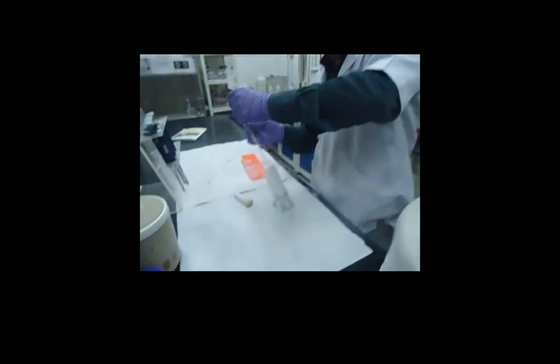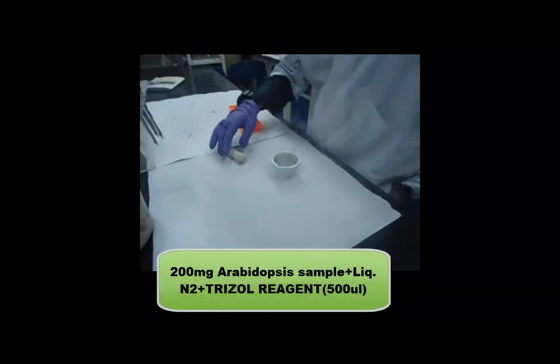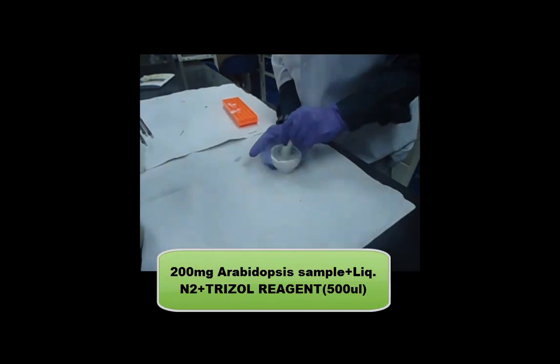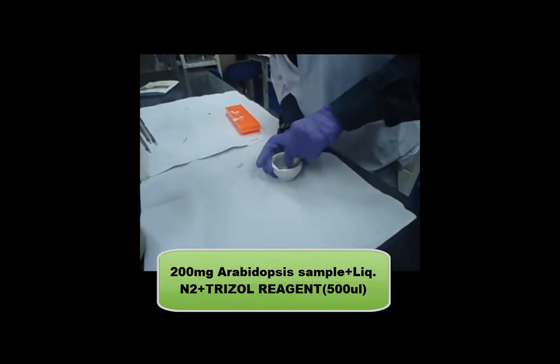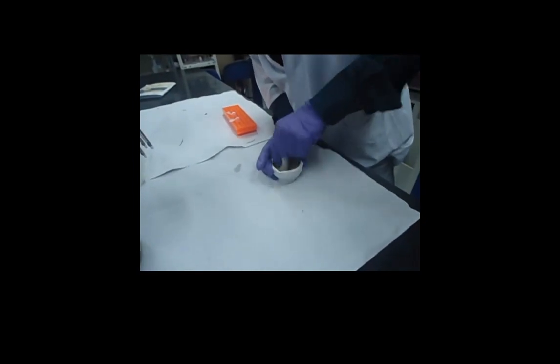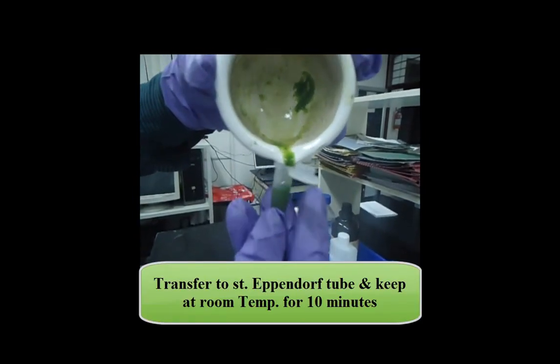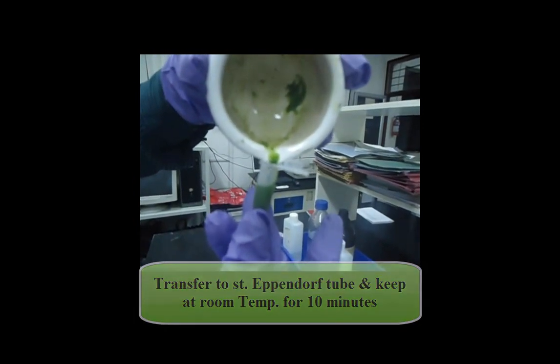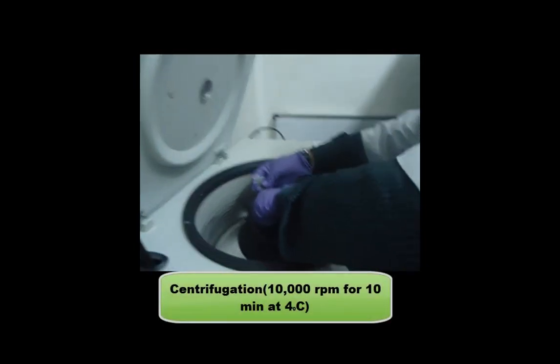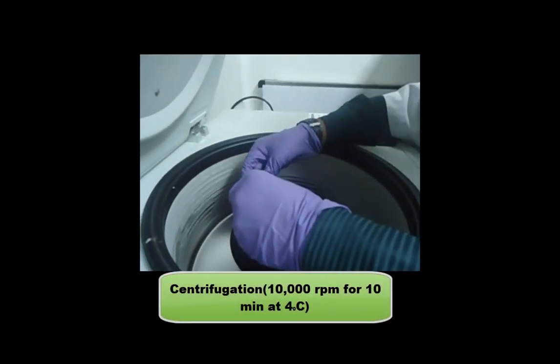First step is the crushing of 200 mg of Arabidopsis sample in liquid nitrogen and trizol reagent. Trizol reagent is added, 500 microliter, and crushed well. Then it is transferred to a sterile Eppendorf tube and kept at room temperature for 10 minutes. Then centrifuge at 10,000 rpm for 10 minutes at 4 degrees Celsius.